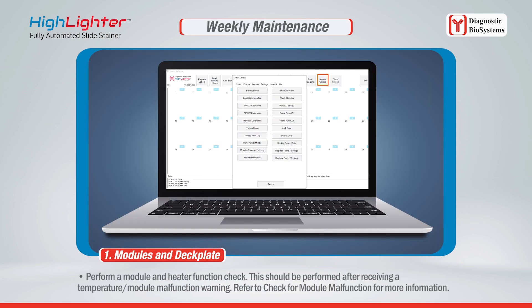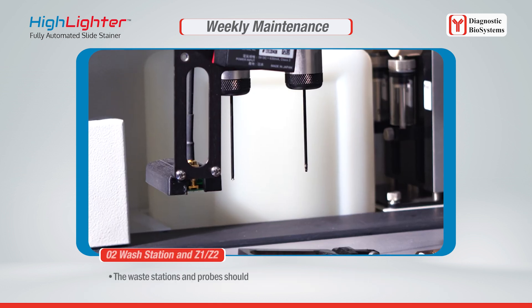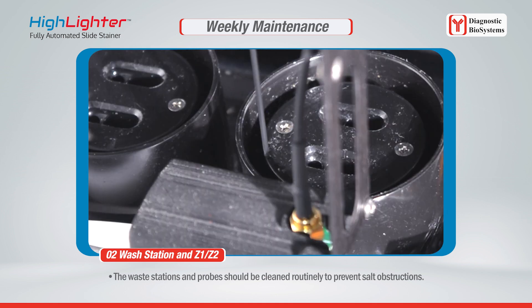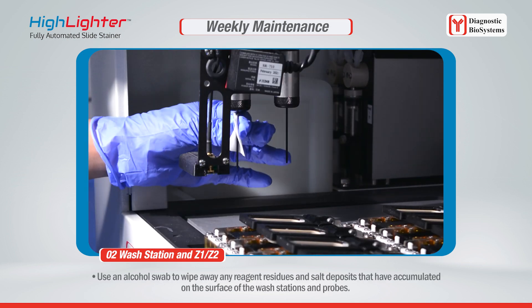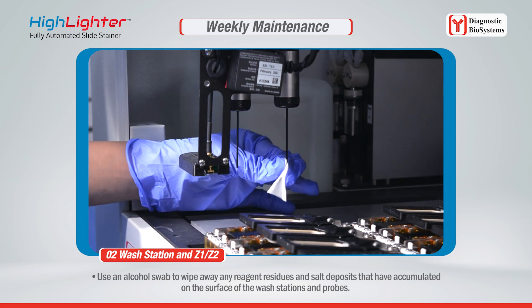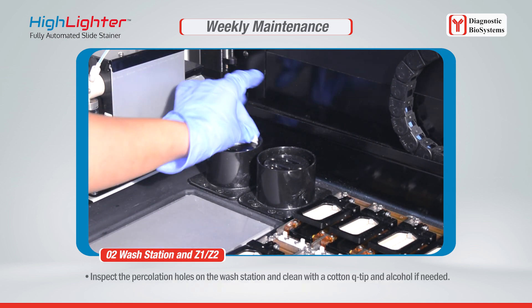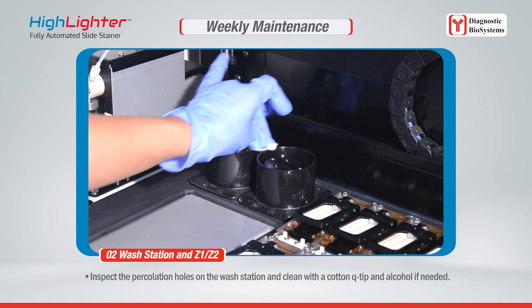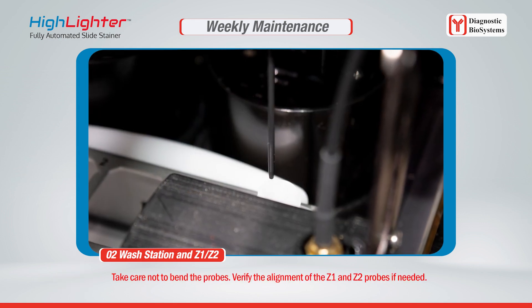Perform a module and heater function check after receiving a temperature module malfunction warning — refer to the module malfunction check for more information. The wash stations and probes should be cleaned routinely to prevent salt obstructions. Use an alcohol swab to wipe away reagent residues and salt deposits from the surface of the wash stations and probes. Inspect the percolation holes on the wash station and clean with a cotton Q-tip and alcohol if needed. Take care not to bend the probes, and verify the alignment of the Z1 and Z2 probes if needed.